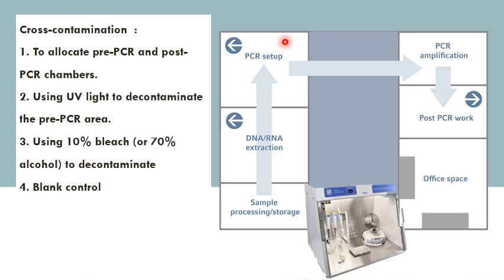And then comes the PCR step where you conduct the PCR techniques, you add your components, you have your thermal cycler, and after that, the post-PCR will be the area where you make the gel and prepare for the gel electrophoresis.